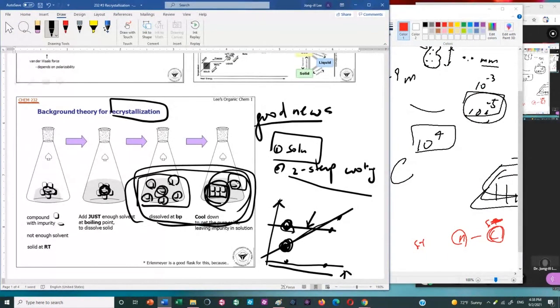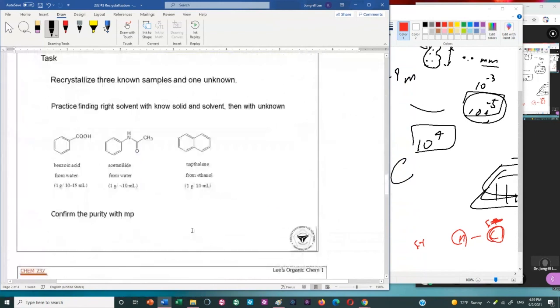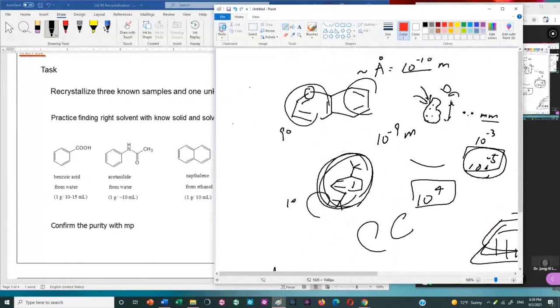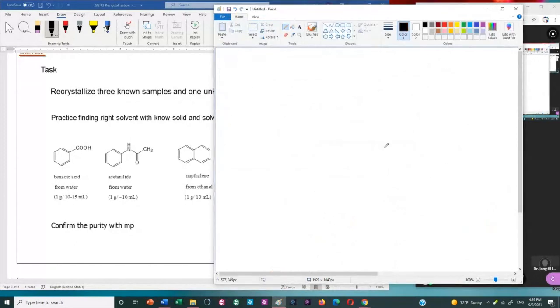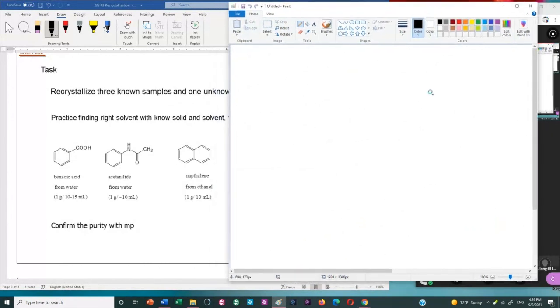First, break things down. Leave the impurity in the solution. And then stack them up, pure stuff together, giving enough time to grow. Last, but most important thing, after knowing fundamentals, this will be connected to your lecture later, but starts now, here.